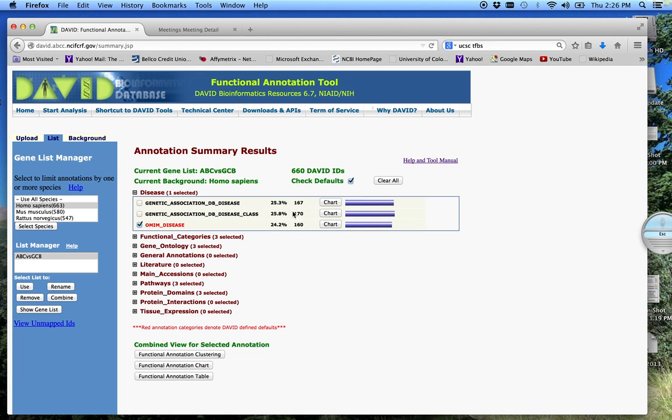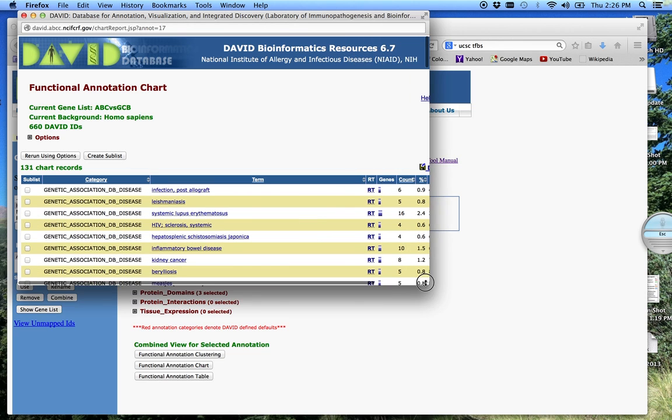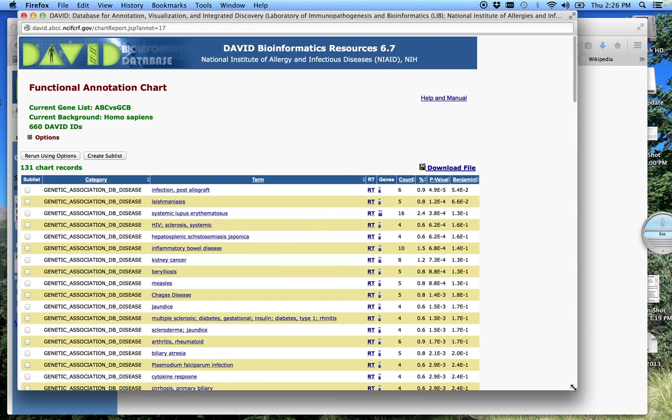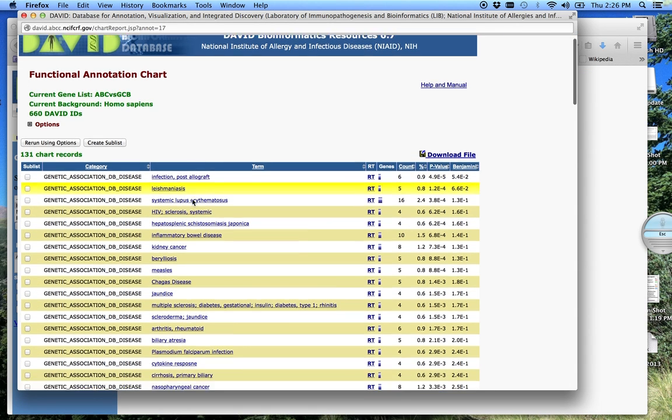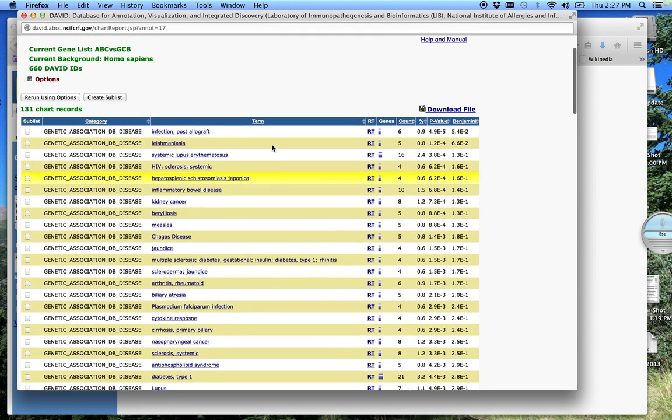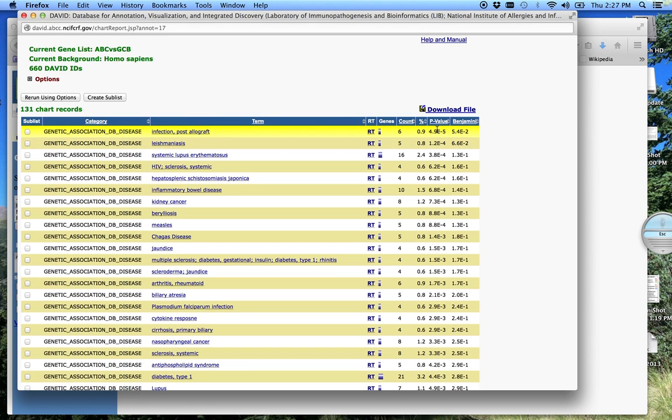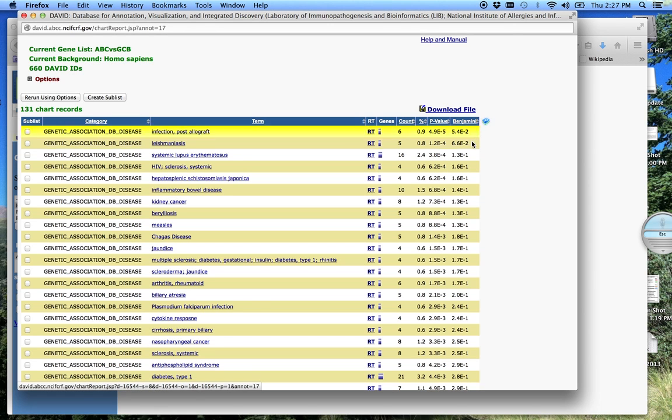We can click on any one of these. I'm going to click on the first one. So in this database, it lists these diseases here. These are the genes that were associated with this particular disease in our gene list. Here is the probability that we would get those genes associated with this particular function by random chance, and you have the multiple correction p-value also given.